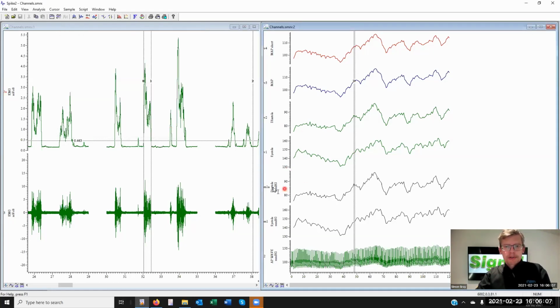So the two outputs are here, M1 and M1A, because this new method produces one memory channel of a real mark. So at each data point, there are values behind it. The first value in this case is the systolic value. The second data value is the diastolic.